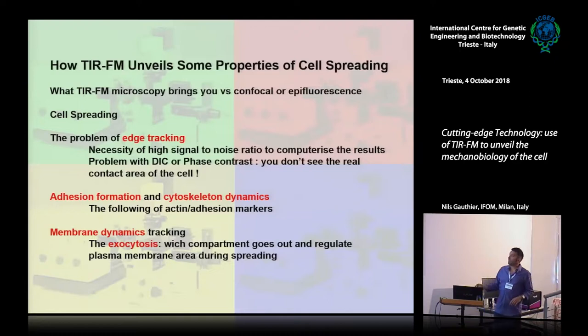Then this is how we define adhesion and cytoskeletal dynamics, and there are many more experiments, but this is really the base, the TIRF-based experiment that I showed you, combined with deep UV microfabrication techniques and a little trick like that. You can really have good answers by always focusing on the brightness contrast and on the quality of your model. But this is the only useful approach.